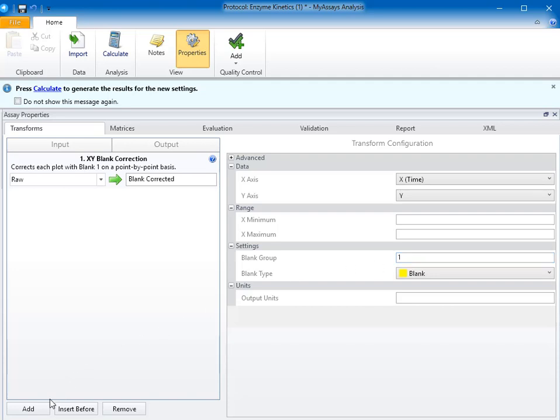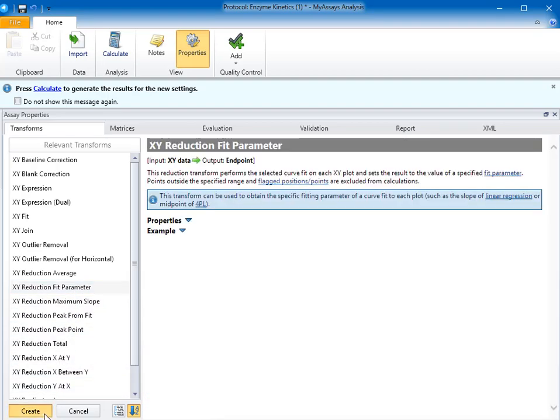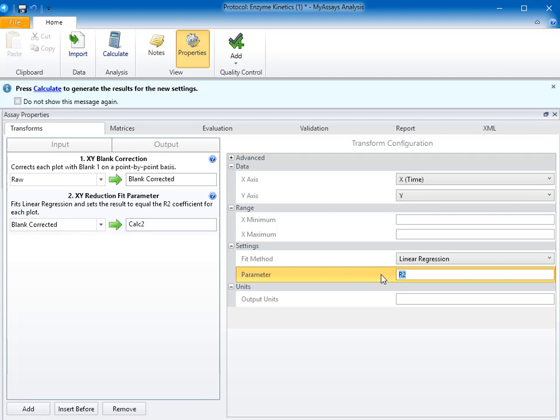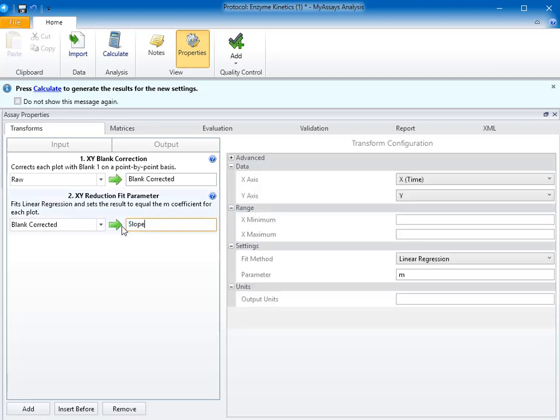Next, to calculate the slope, I'll add an XY reduction fit parameter transform. This transform will report the specified parameter from the selected fit method. I'd like to fit a linear regression to my data, and in the Y equals MX plus B linear regression equation, M is equal to the slope. So for the parameter, I'll enter M and rename this output matrix to slope.